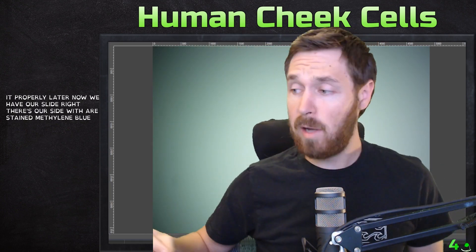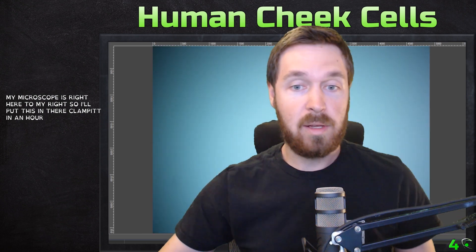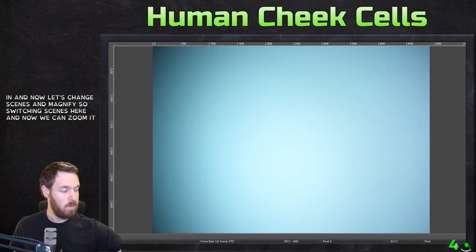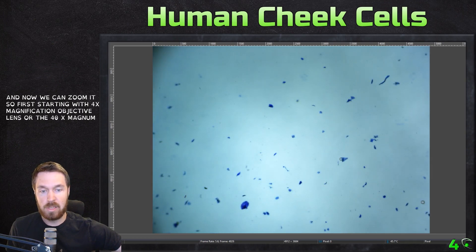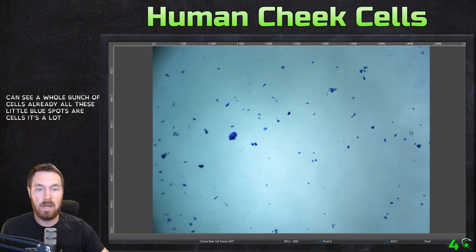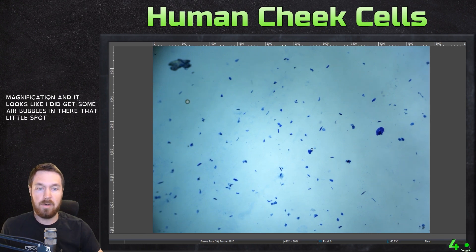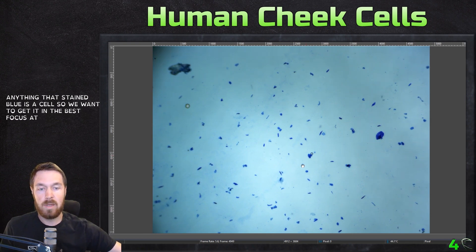There's our slide with the methylene blue stain. My microscope is right here to my right, so I'll put this in and clip it in. Now let's change scenes and magnify. Starting with the 4x objective lens — that's 40x magnification. Look, we can see a whole bunch of cells already. All these little blue spots are cells. Lots and lots of cells at only 40x magnification. It looks like I did get some air bubbles in there — that little spot is an air bubble — but anything stained blue is a cell.